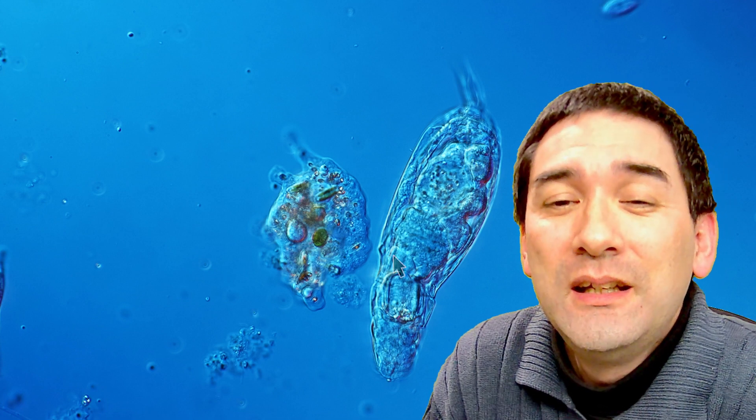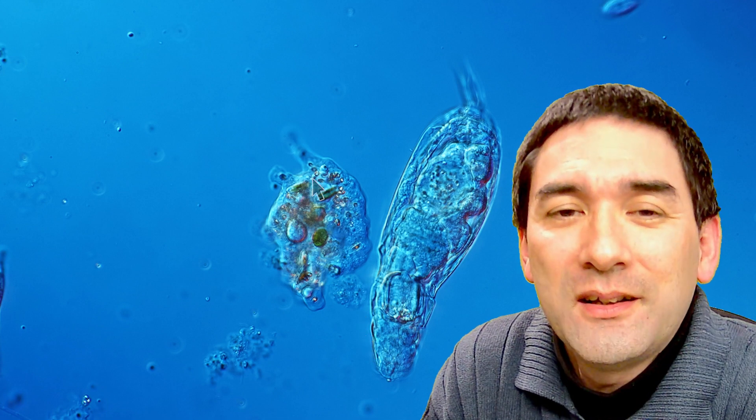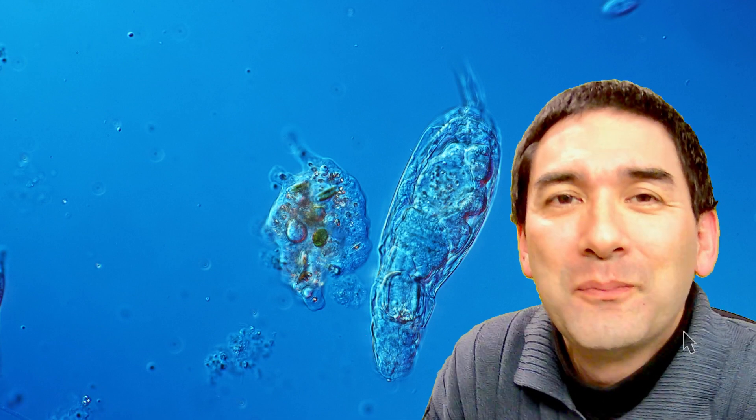Actually the individual cells must be significantly smaller obviously than this gigantic amoeba that you see over there. Let's move on again a little bit.